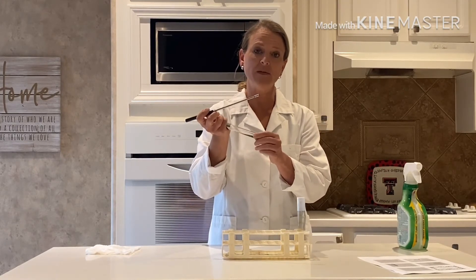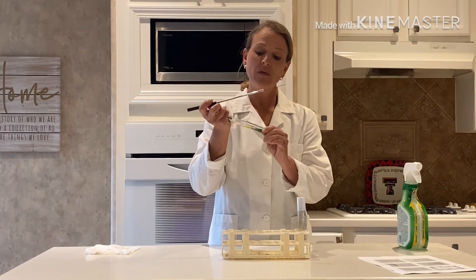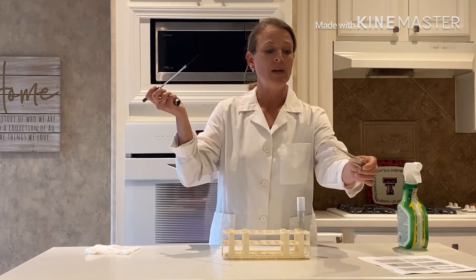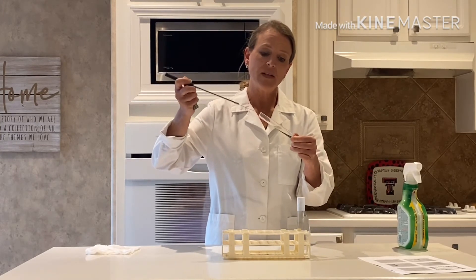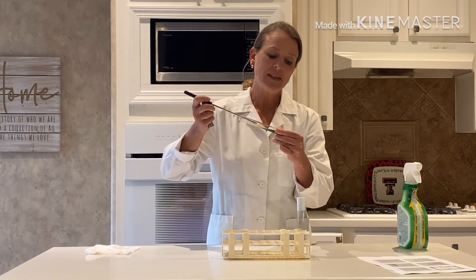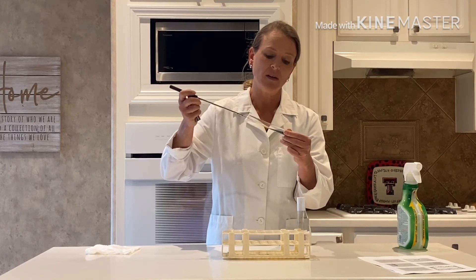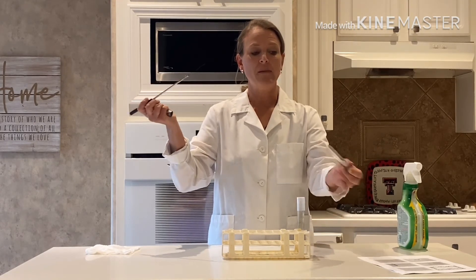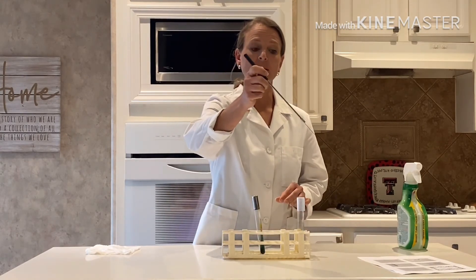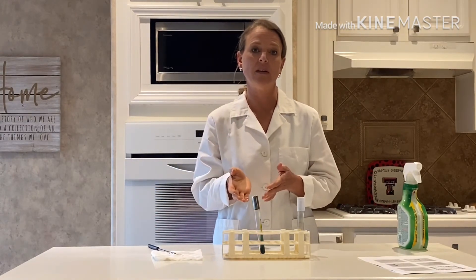When we transfer into a slant we are going to use the fishtail method. I'm going to remove the lid of my Simon Citrate agar slant and pass it through the flame. I'm going to take my bacteria and start down at the bottom of the slant, then very gently zigzag my way up the slant, making sure not to damage the agar. Then I'll flame my test tube, put the lid back on, and flame my inoculating loop — and we have successfully done a transfer into a Simon Citrate agar slant.